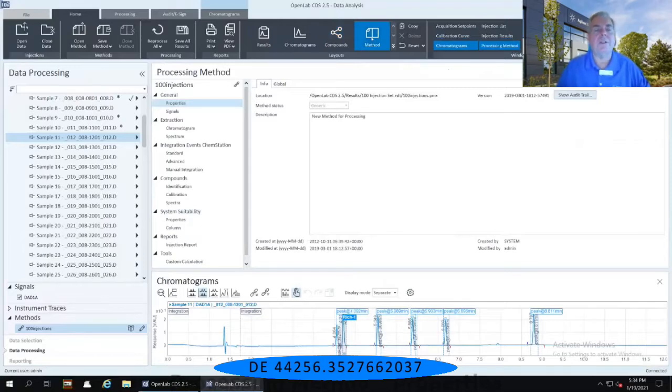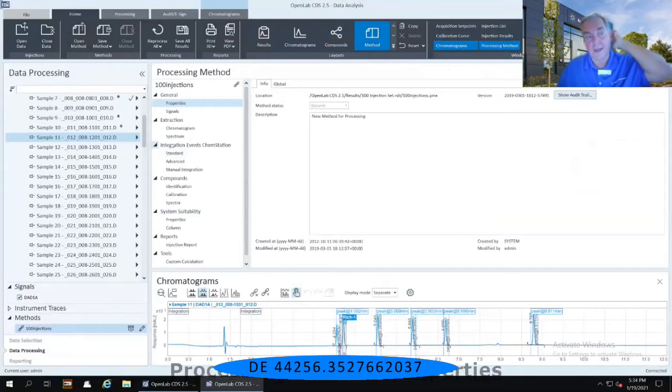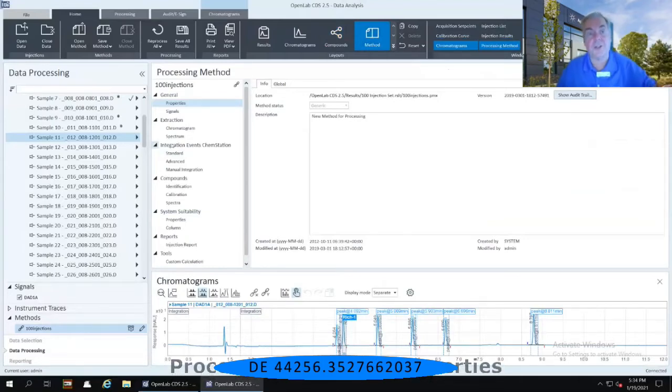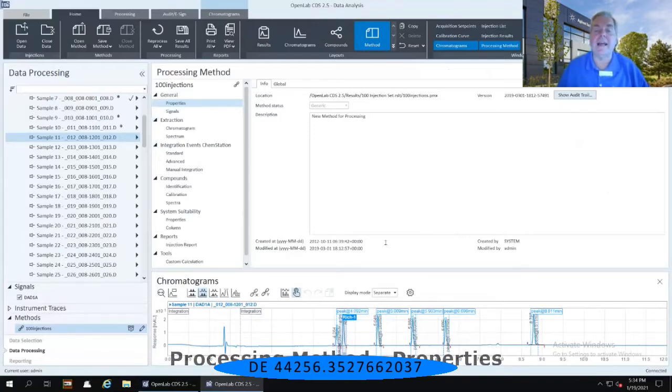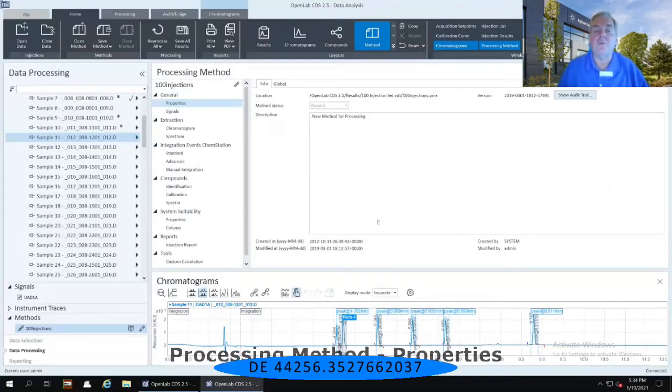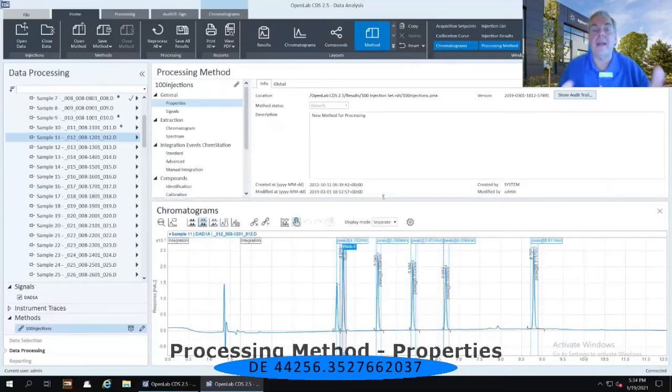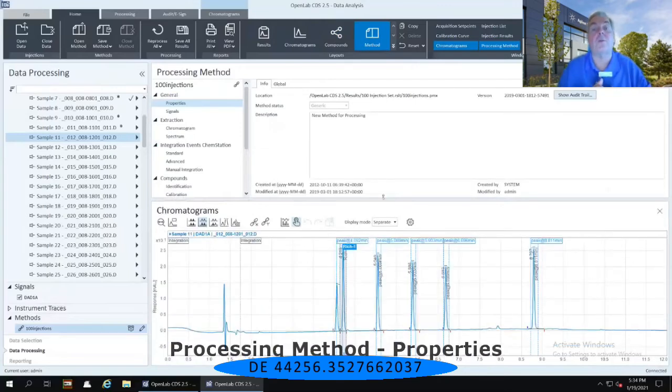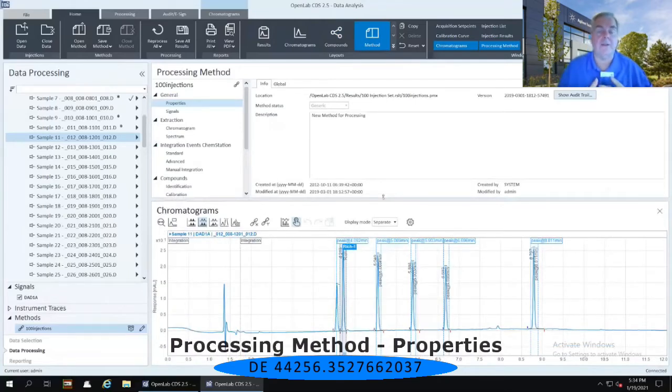Now, you'll notice that on the left-hand side, again, we still continue to have the data processing and then all of the list of injections. Then in the right-hand panel, we've got the processing method, and then down below on the right-hand panel, we have a window for the chromatogram that's currently highlighted on the left.